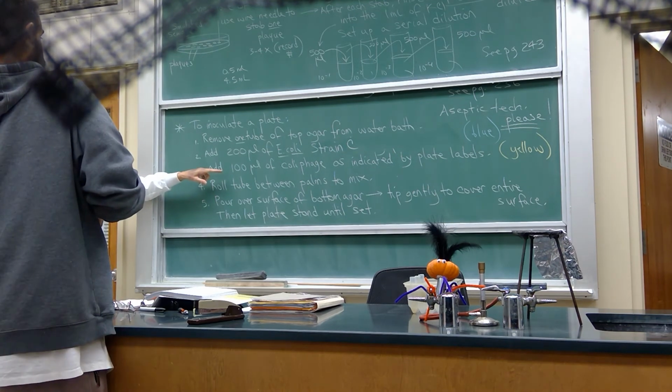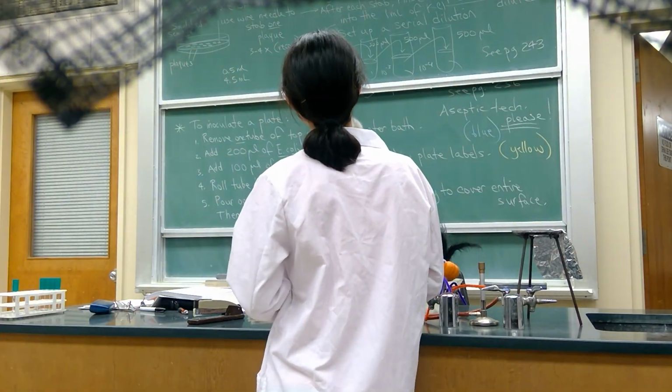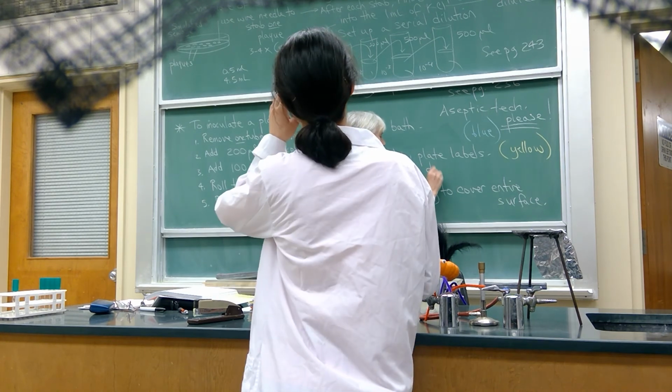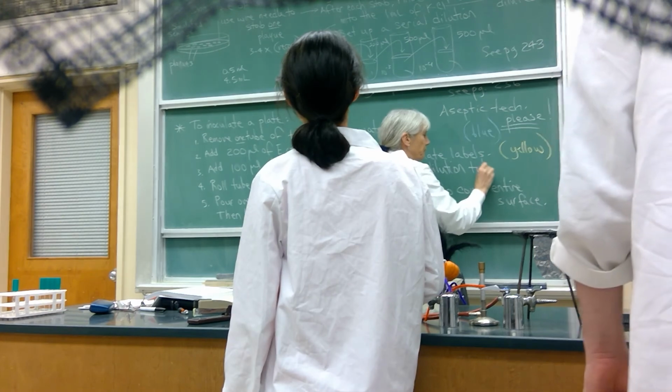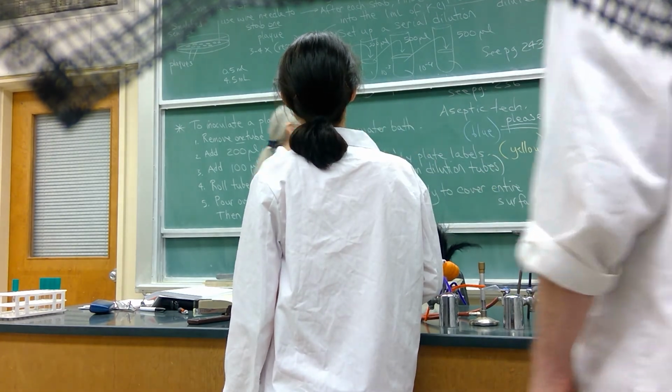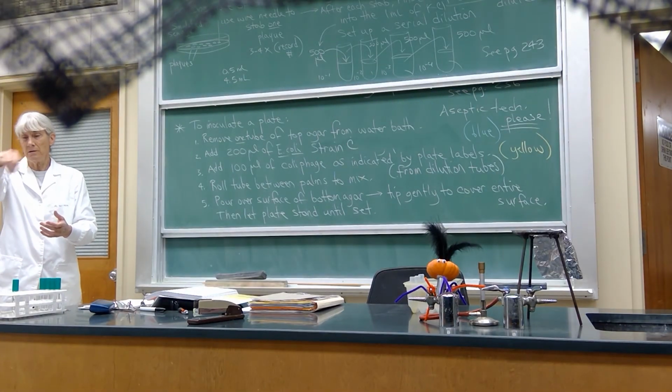Yes, we need to boil 2 more top agars. Can you do that before everyone takes it all? Yeah, your dilution. Gotcha, alright. Okay, jab it in.